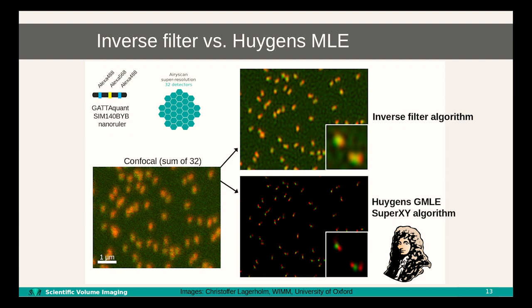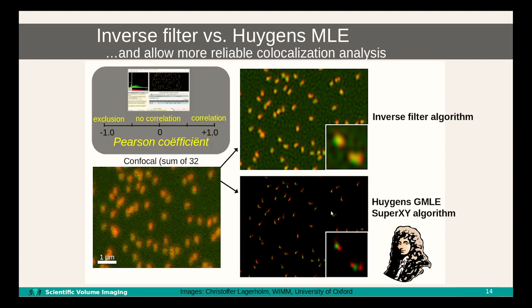This slide shows an ARRI scan dataset deconvolved with an inverse filter algorithm and compared with the Huygens GMLE approach. The objects are GataQuant nanorulers where the outer fluorophores are spaced 140 nanometers apart, with an extra fluorophore at a different wavelength exactly at the center. In the GMLE result, we can directly appreciate the resolution increase and significantly reduced background. This is in clear contrast with the inverse filter approach, where a lot of background remains and artifacts are visible in the background. The obtained resolution is obviously clearly worse compared to the MLE approach.